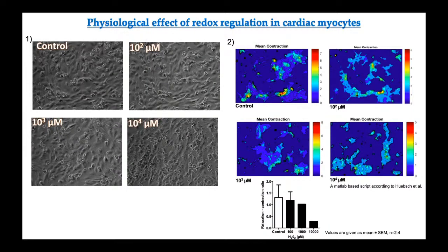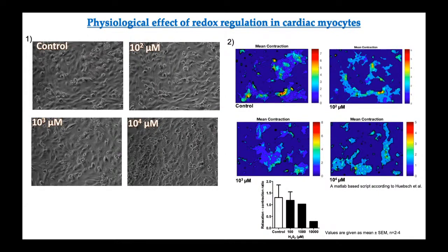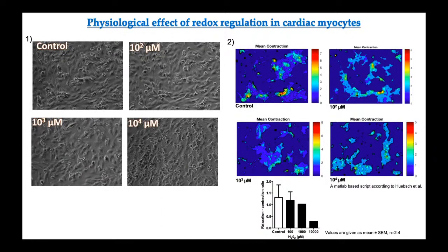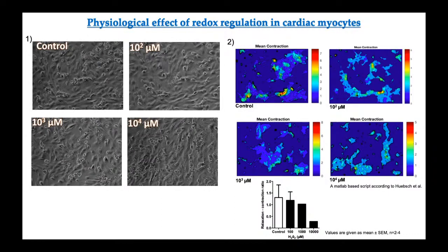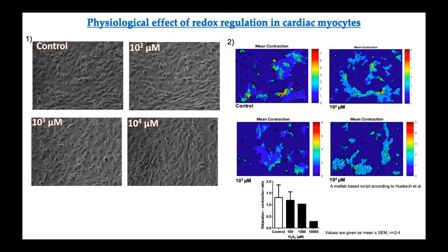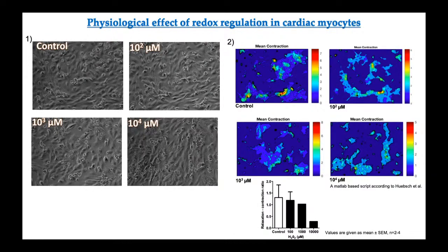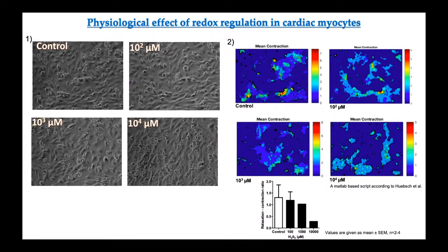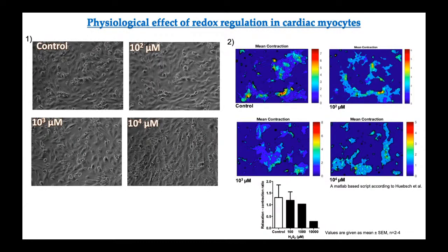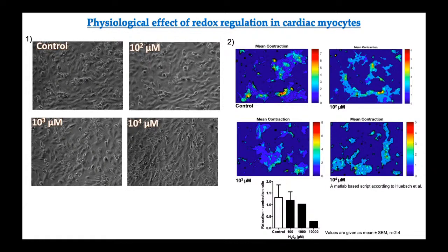You can do the same experiments with any cell line, whether it's a liver cancer cell line, skin cells, liver cells, lung cells, kidney, any cells, HEK cells. So all these things are possible. So that's what the images look like.